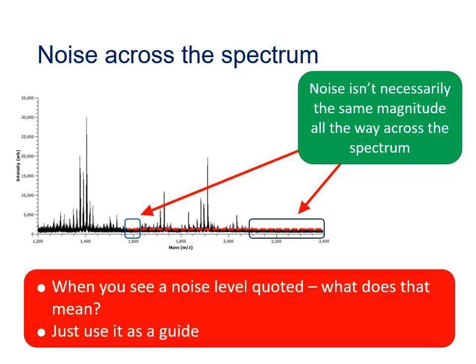What this means is that a measure of the noise shouldn't be taken as a precise measure, but should really only be interpreted as a guide. And by and large, it is generally only appropriate and necessary to give the signal-to-noise ratio in a mass spectrum to the first significant figure. If you're ever required to present a noise measurement yourself, you should always state exactly how you calculated it.